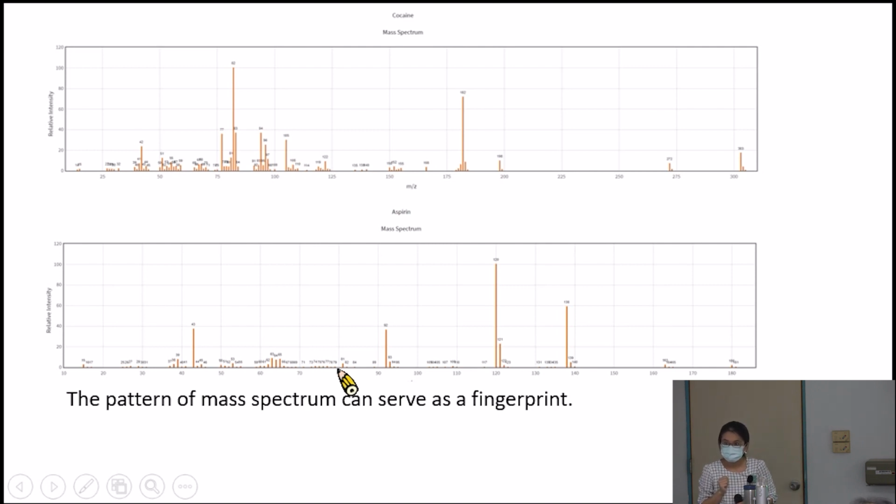So that's what they use? There are multiple approaches. Some approaches use this, but they have a limitation, because it means I need to have the standard. I already know what it looks like, and I can get what I want. But it's not possible to analyze all of the compounds in the world. So the limitation is we do not have enough standard references to reflect your metabolites.